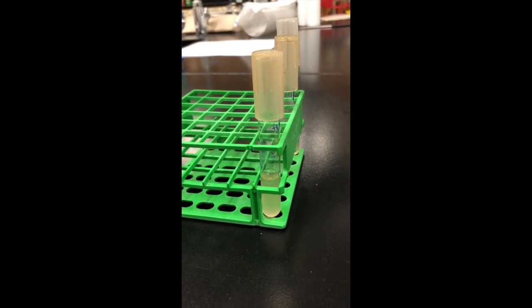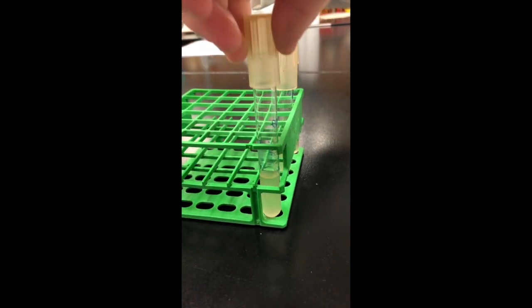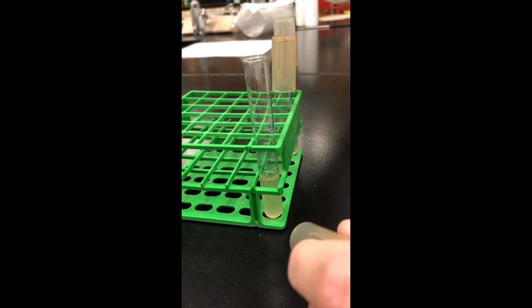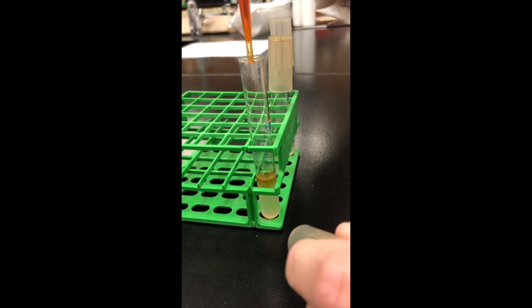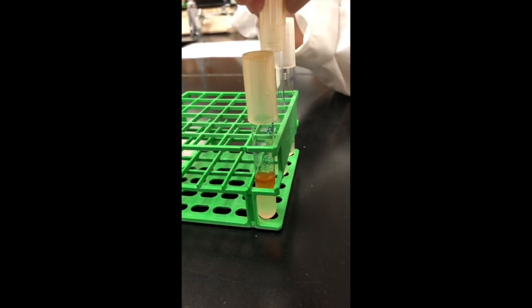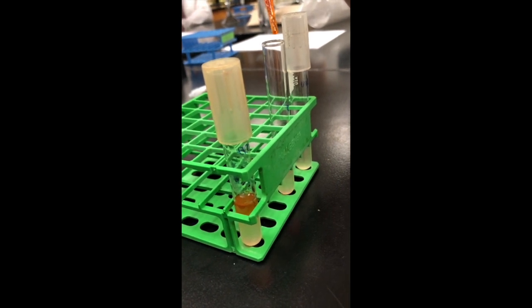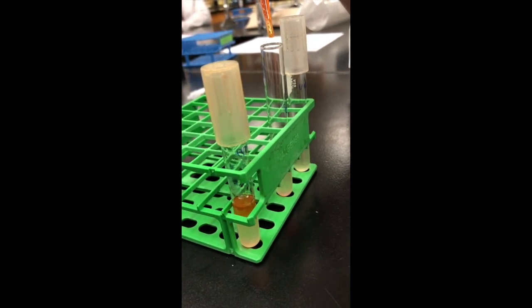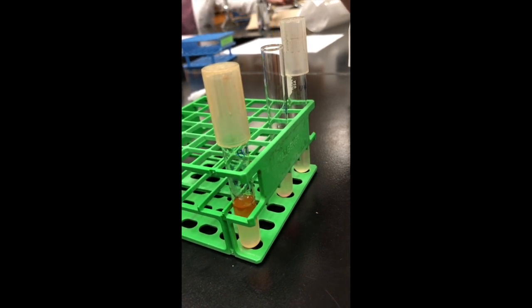We're going to add 7 drops. That was probably about 6. All right. Not an exact science when I'm doing it. 2, 3, 4, 5, 6, 7. Right.